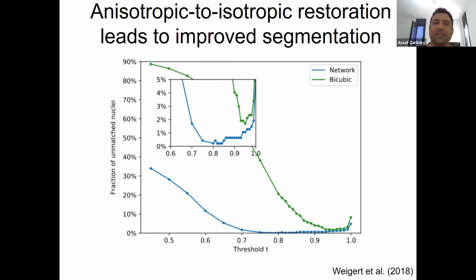Okay. So basically, the idea is to show that the blue is much below the green, which shows the potential of just improving the images artificially and how it can improve what we are really interested in, which is something that relates to tracking the cells.